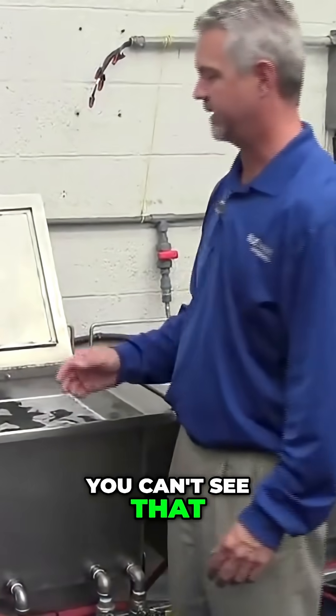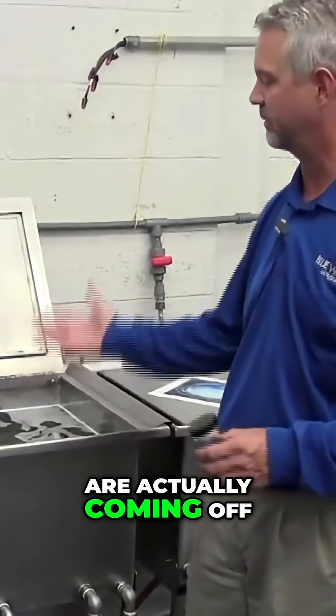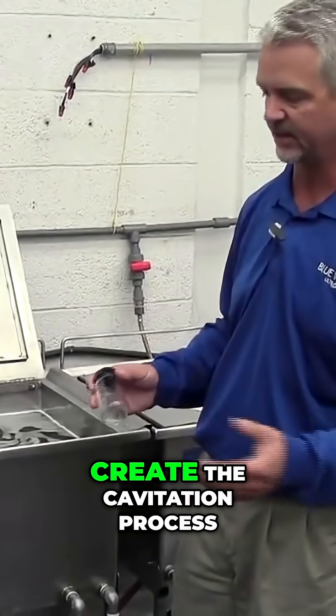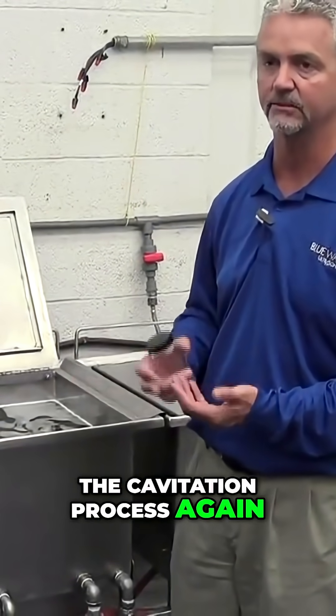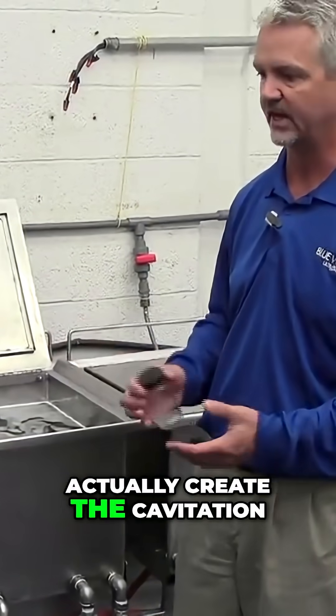You can't see that, but we can show the pressure waves that are actually coming off the tank bottom, which are required to create the cavitation process. It's not the pressure waves that clean the part — it's actually the cavitation process — but you need the alternating pressure waves back and forth to actually create the cavitation.